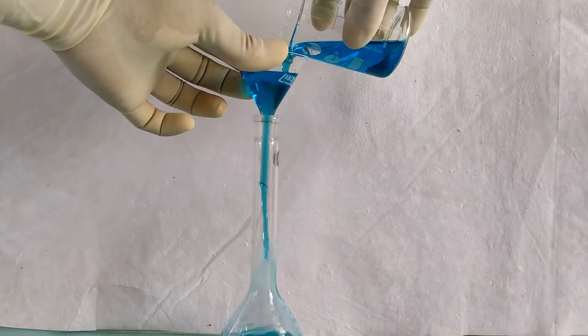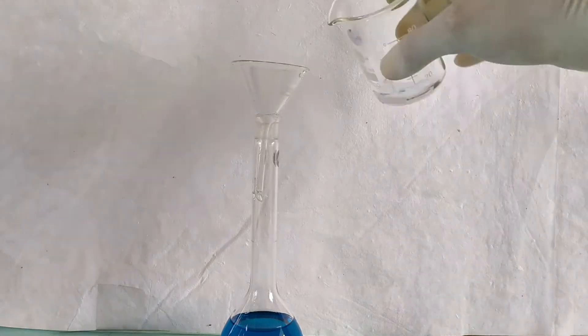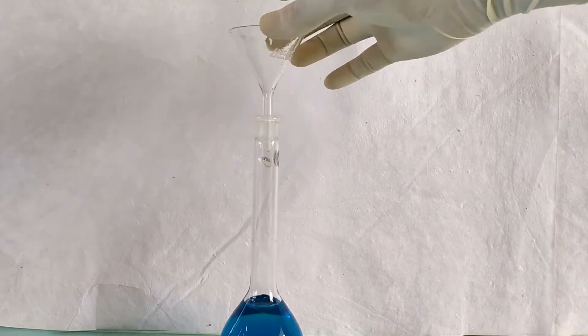Transfer the solution into a volumetric flask. Rinse the funnel, the beaker and the stirring rod using small amounts of distilled water. Make sure that the final volume after the rinsing process does not cross 100 ml.